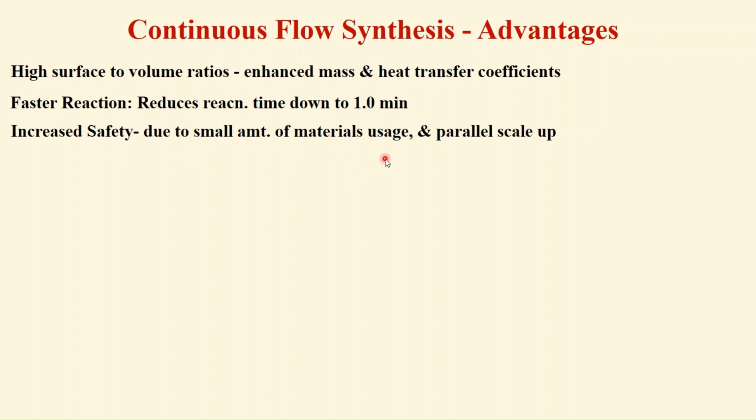Not only does it increase the safety, parallel scale up is also possible stepwise. As the reactors are of microliter capacity or few milliliter capacity, the consumption of reagents, solvent and energy is also reduced enormously.